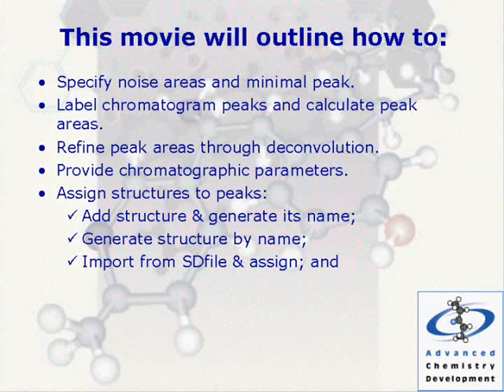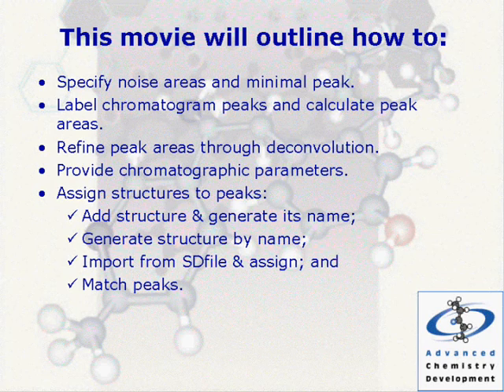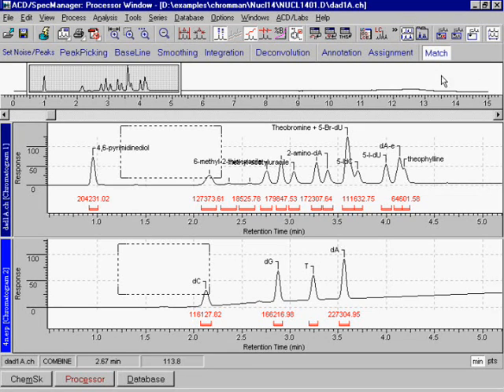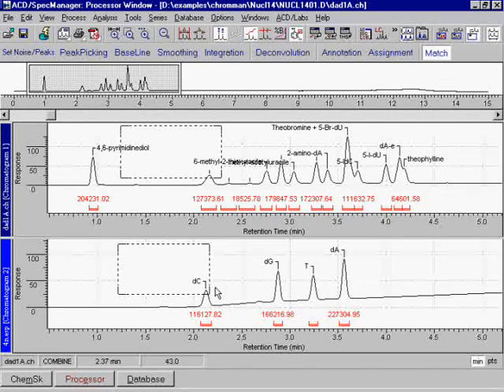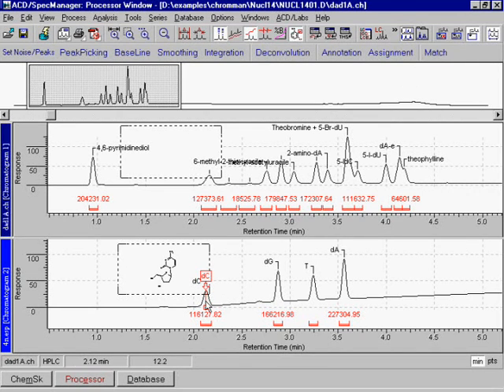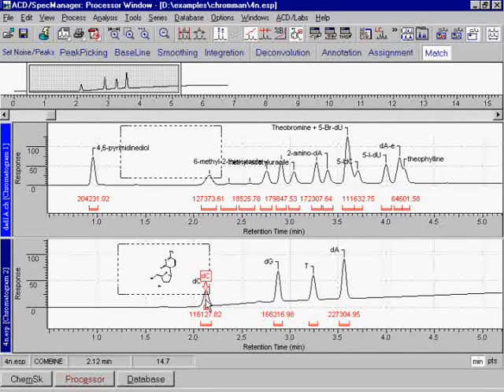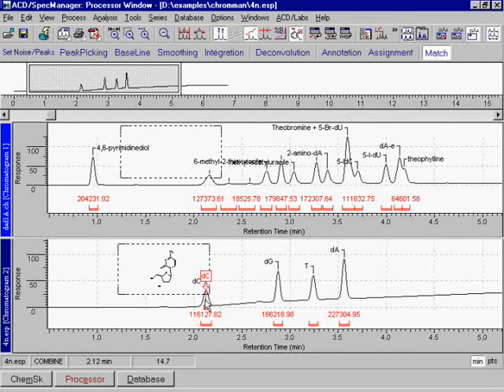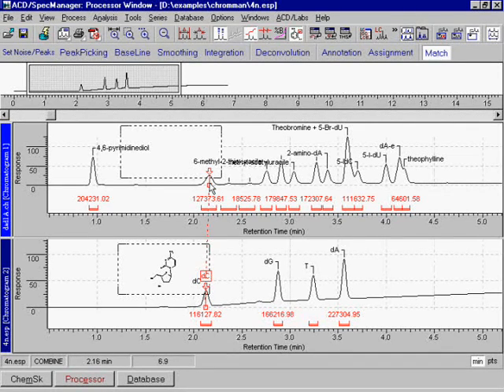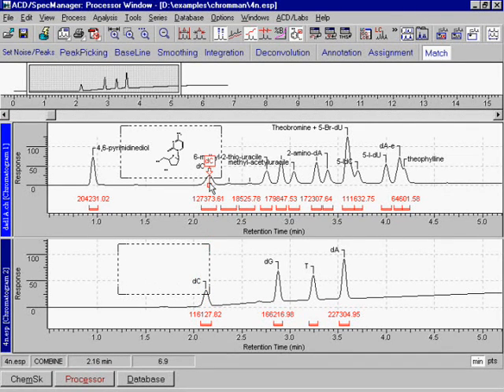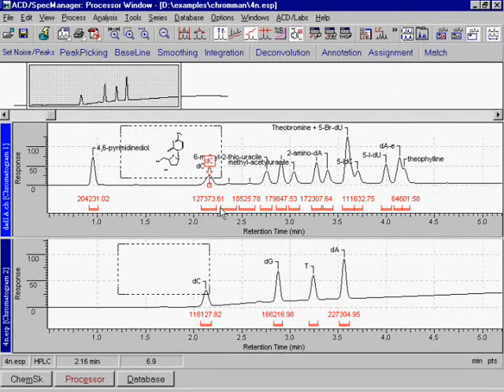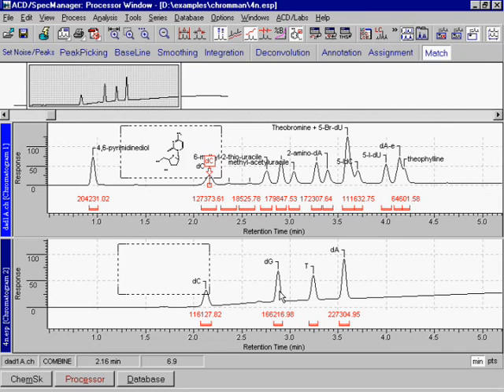Match peaks of different chromatograms. Any previously labeled chromatogram can be used to process similar separations. Corresponding structure assignments can be matched between chromatograms to facilitate assignment. Note that several structures can be assigned to the same peak, as you can see in the floating window.